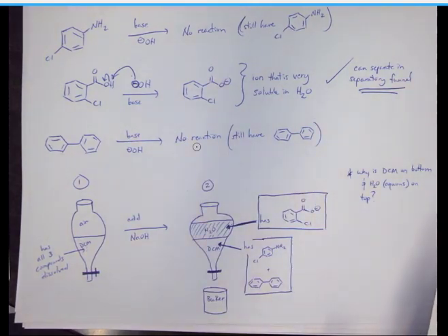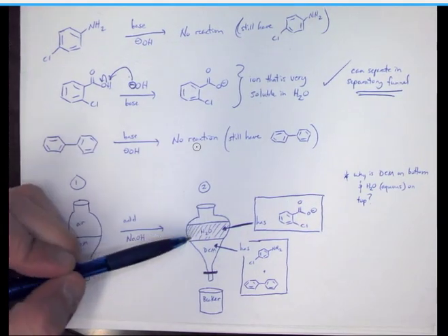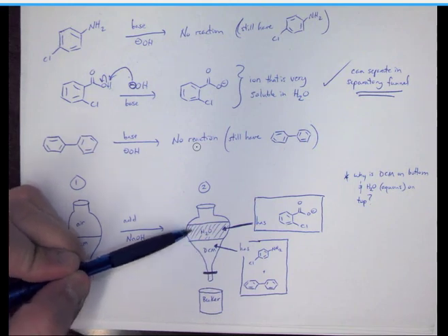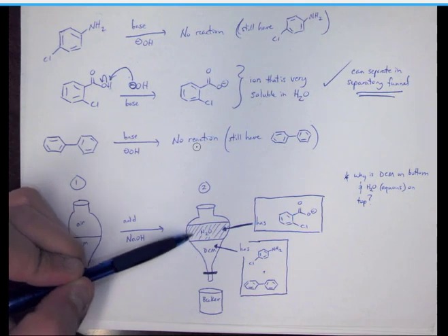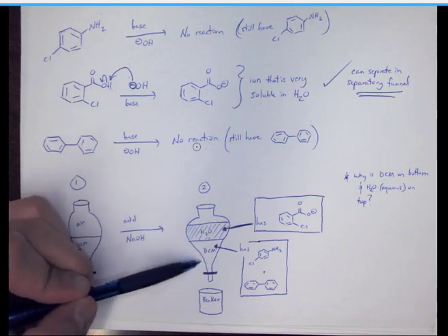So I don't want you to think that every time you use a separatory funnel the water is going to be on the top, and that the aqueous phase is on top and the organic phase is on the bottom. It depends on the densities of your two solvents.